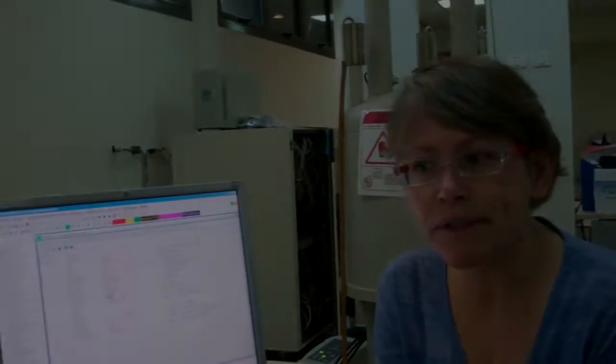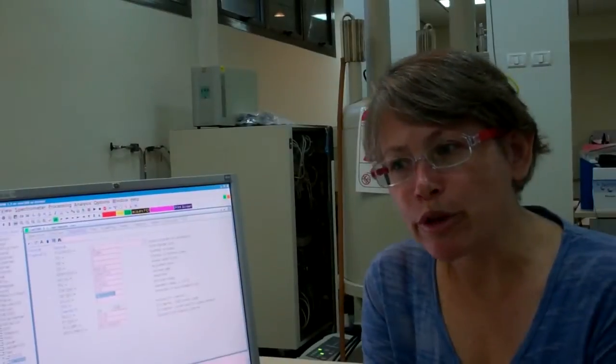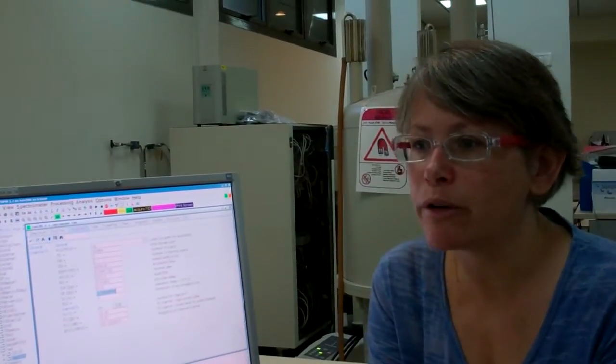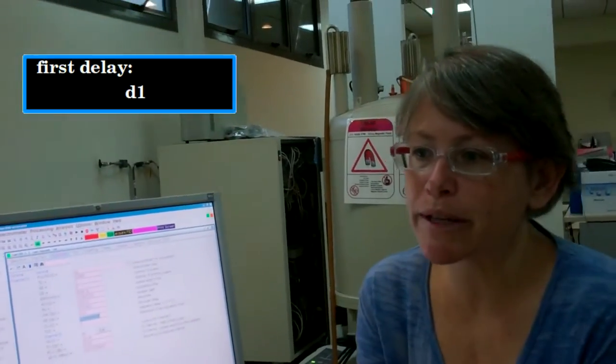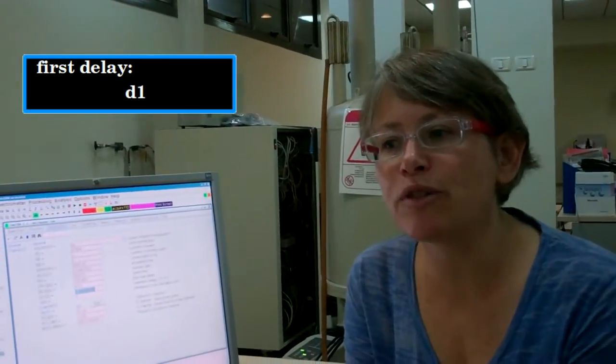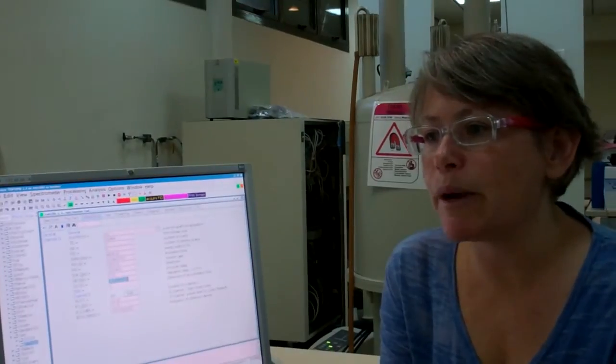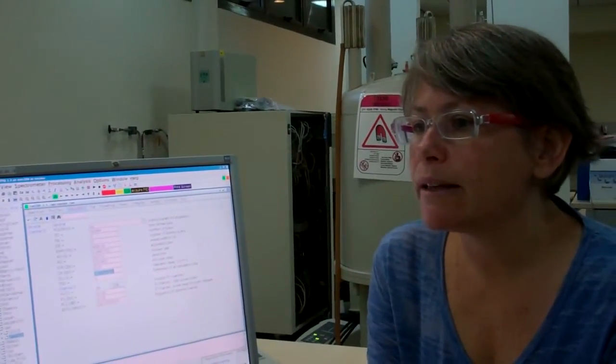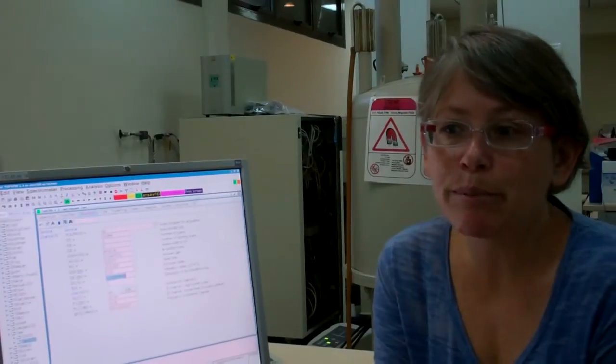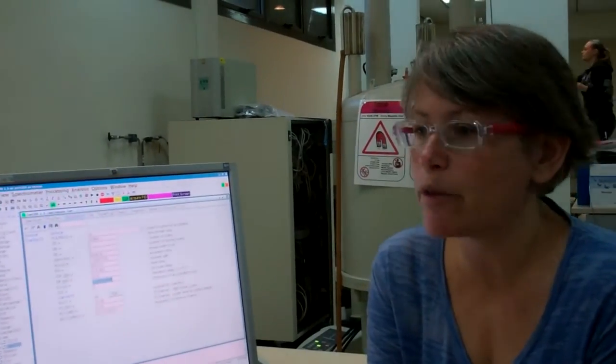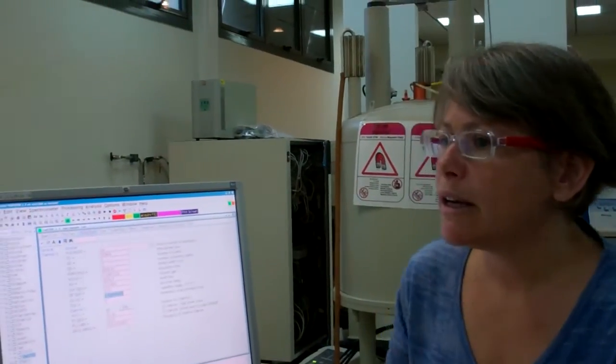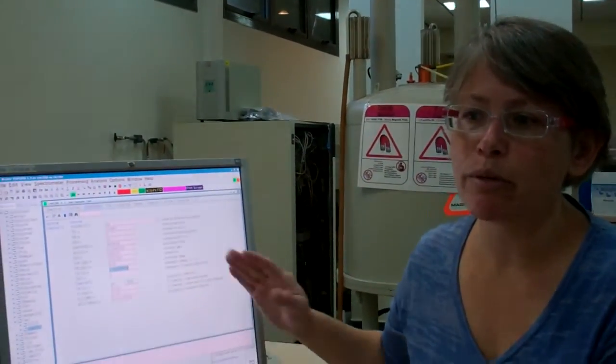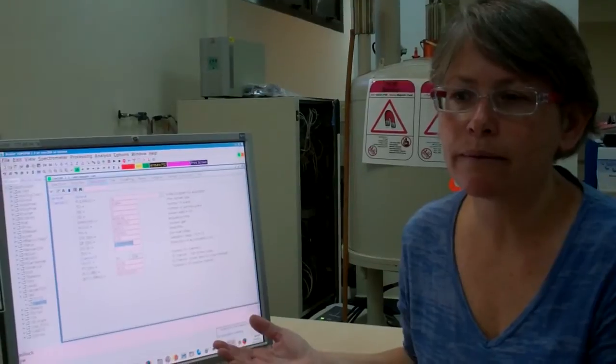The spectrometer can either pulse or not pulse. The pulse program we've requested tells the timing unit of the spectrometer to wait D1 seconds before the RF pulse in our pulse acquire experiment. D1 is the first delay. In this experiment, it is the only delay. The difference between all the NMR experiments is in the placement, numbers, and durations of the pulses and delays. In the margin here, it is written that we should set D1 from 1 to 5 times T1. What is T1?